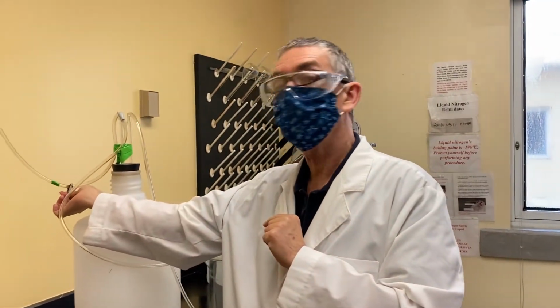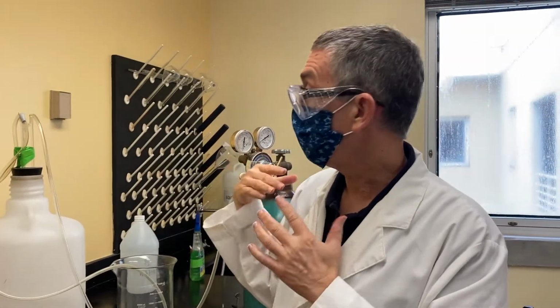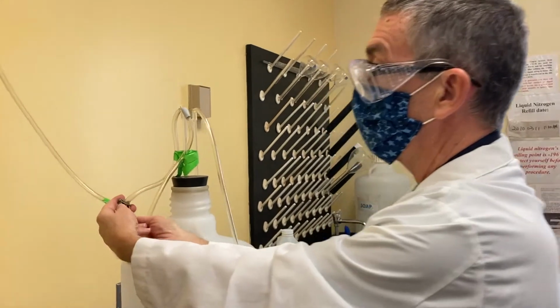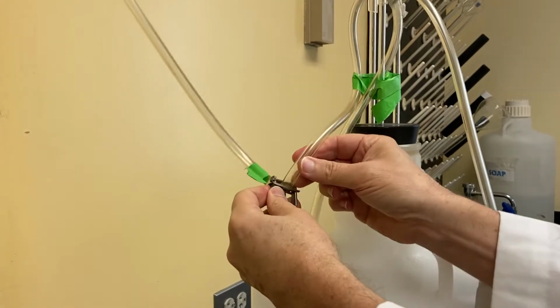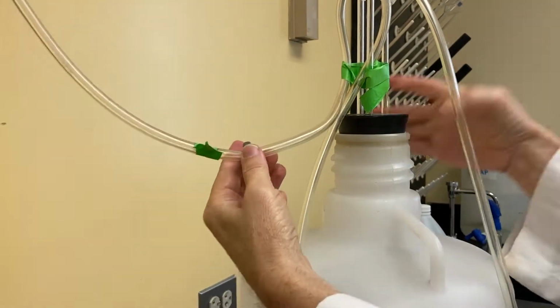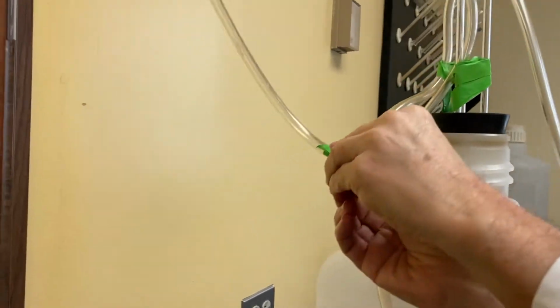Go and touch the clamps, try to close them and open them. Make sure you're familiar with how they all operate. So this one, for example, opens and closes right here. To get the best seal, you'll want the tube to be in the middle. See, it's a little hard. I have to twist it here. You want the tube to be in the middle, if you can see.